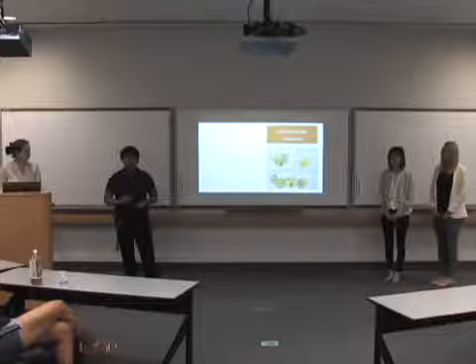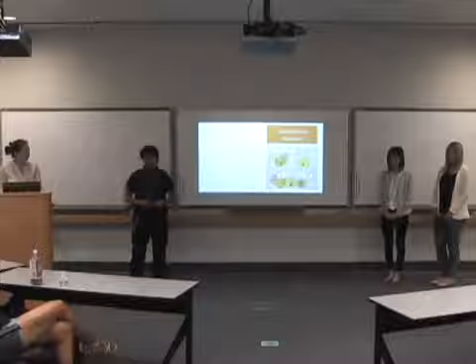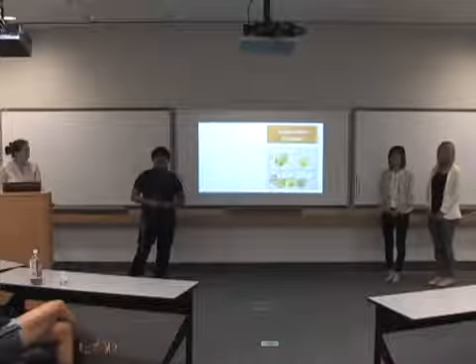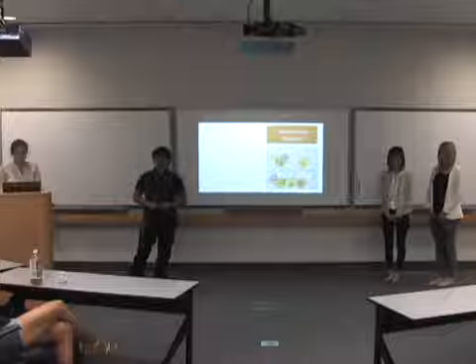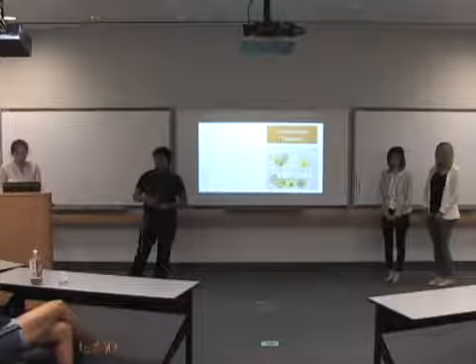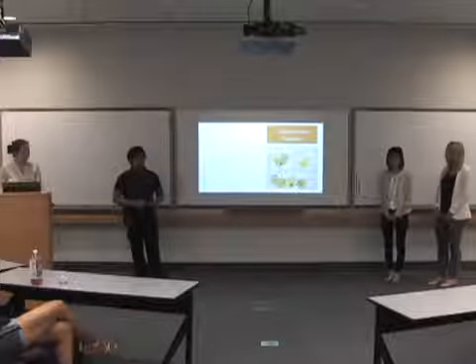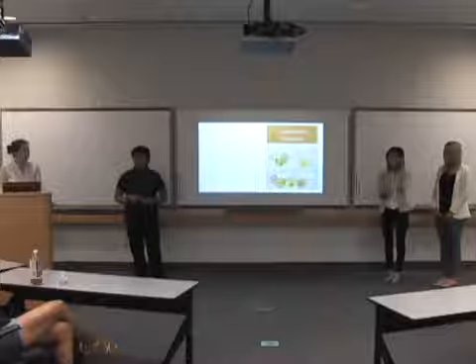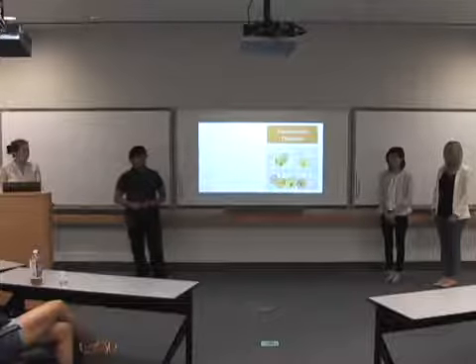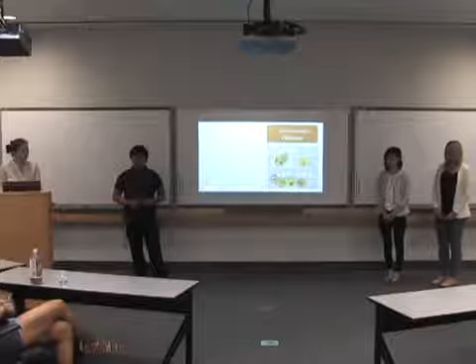That's why we were in charge of looking for a model peptide sequence. But this model was designed to teach us the skills and procedures used by the other scientists in the lab we worked with. And they used these same skills and procedures to find the cause of autoimmune diseases, therefore helping prevent them and hopefully one day curing them. Now, my partner Tui is going to take you through generating a peptide library.